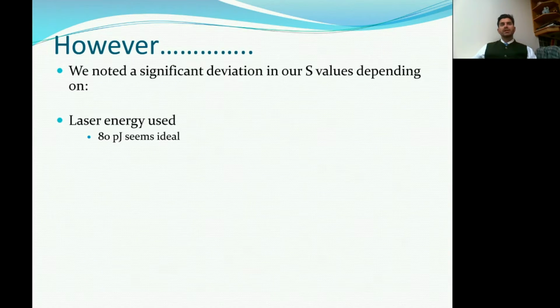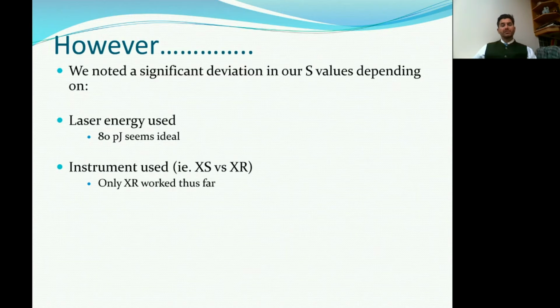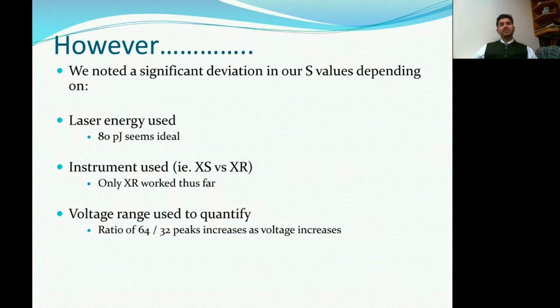This comes with a big caveat: we had to do a lot of scratching our heads in terms of the instrumental artifacts. There's a very specific set of conditions that gives us the right answer, 80 picojoules. We've only managed to get it to work on the XR. There's a very specific voltage range over which this works.